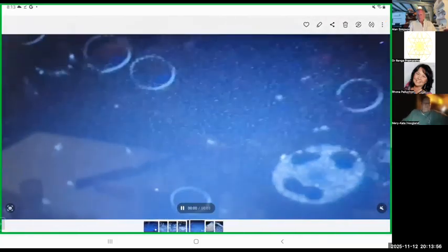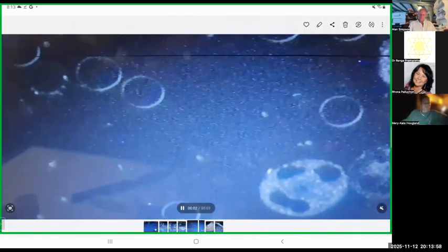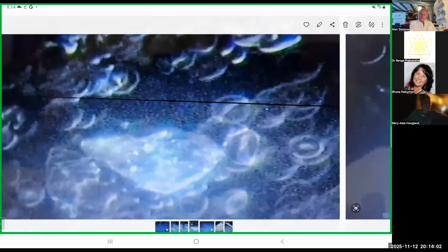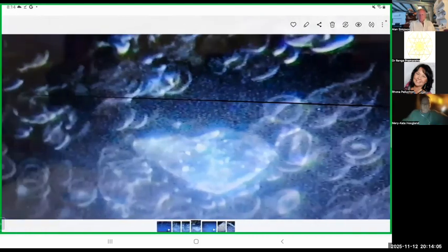So this is how the blood should be. You can see this is a very short video. This is another one where the blood is very aggregated. You can see big clumps on the left corner and the bottom, and then another protein with this acid, uric acid.